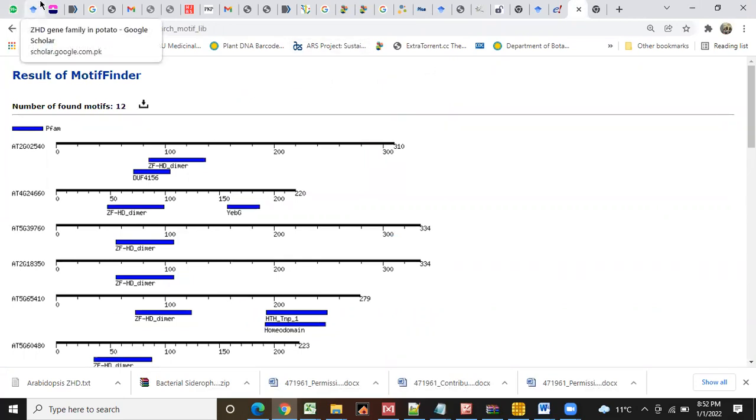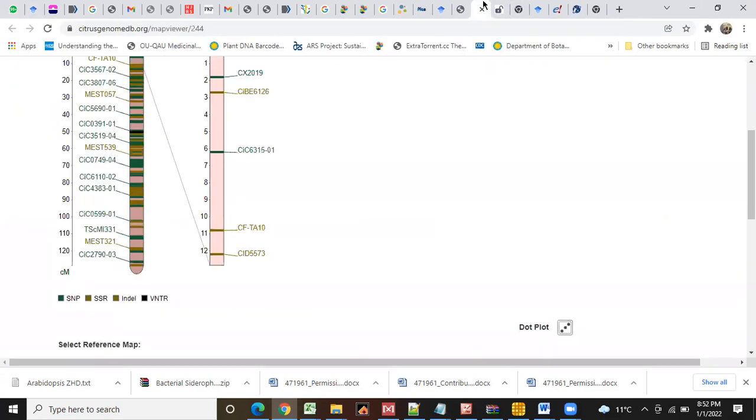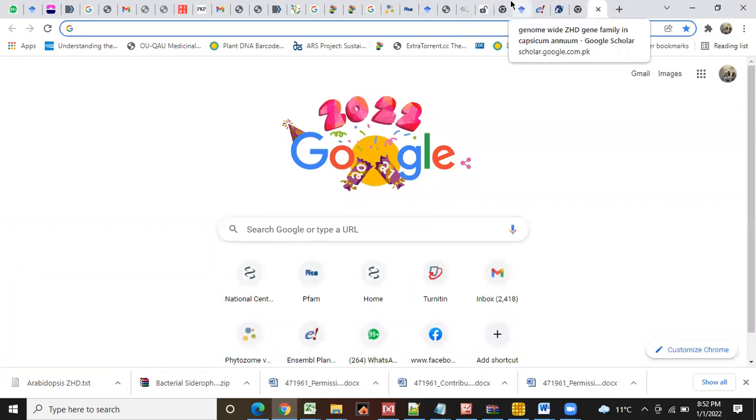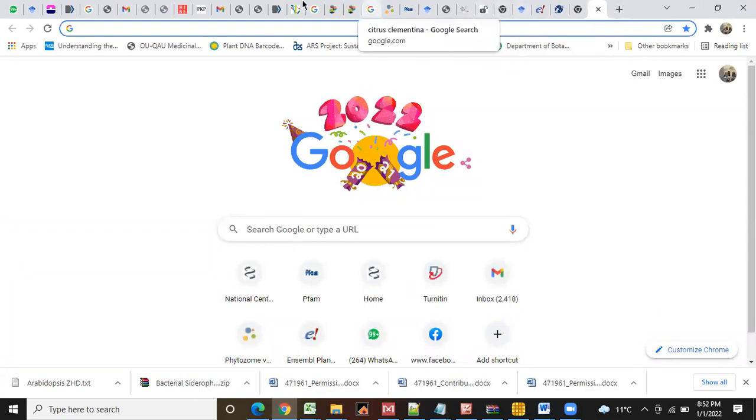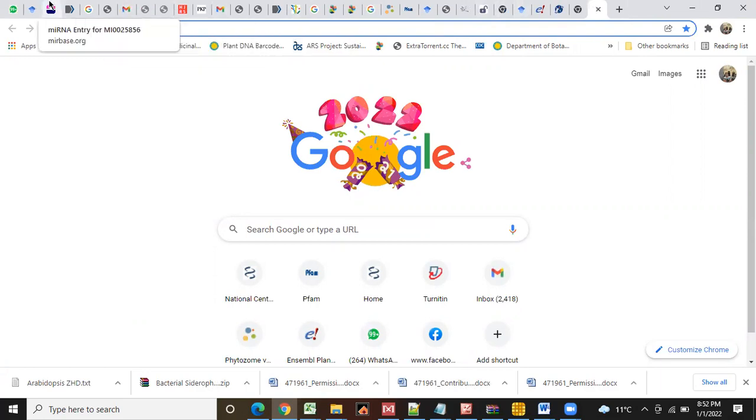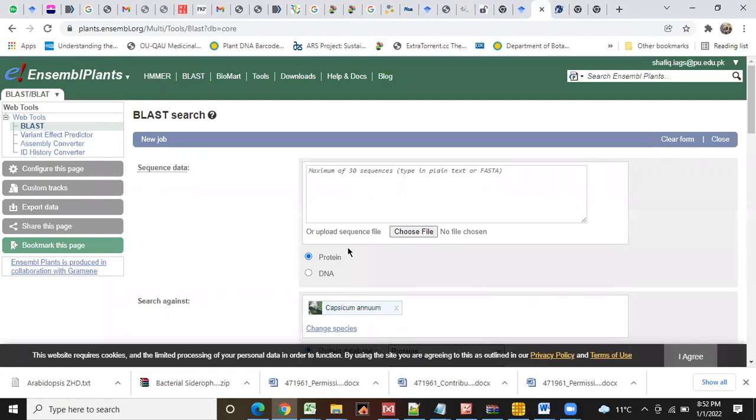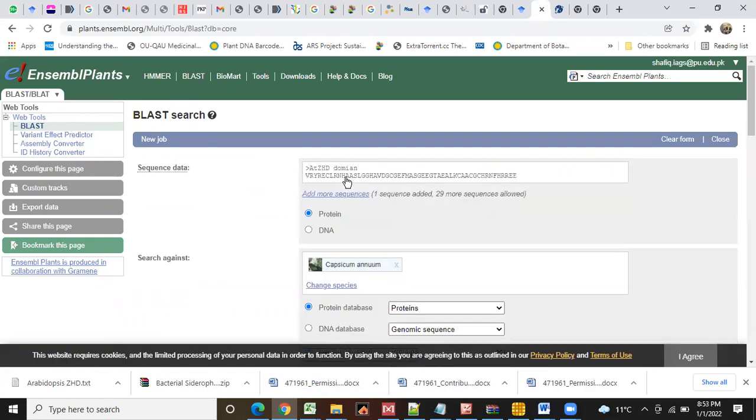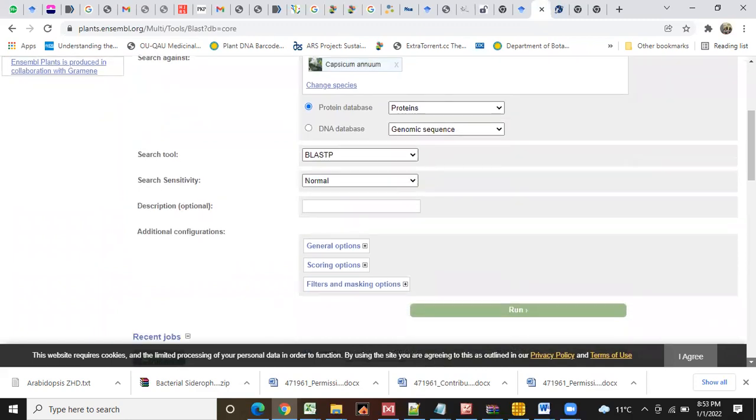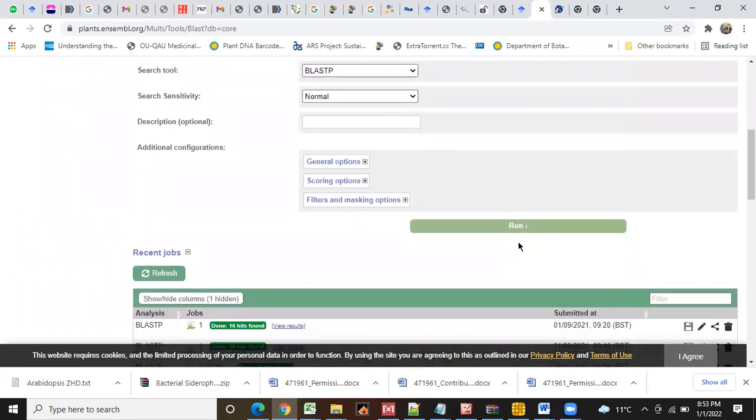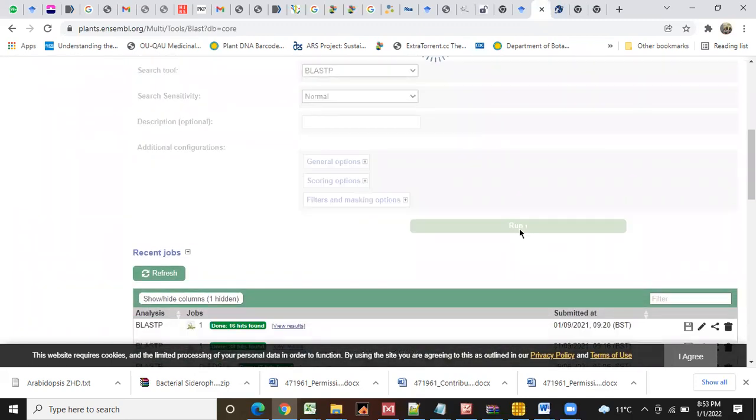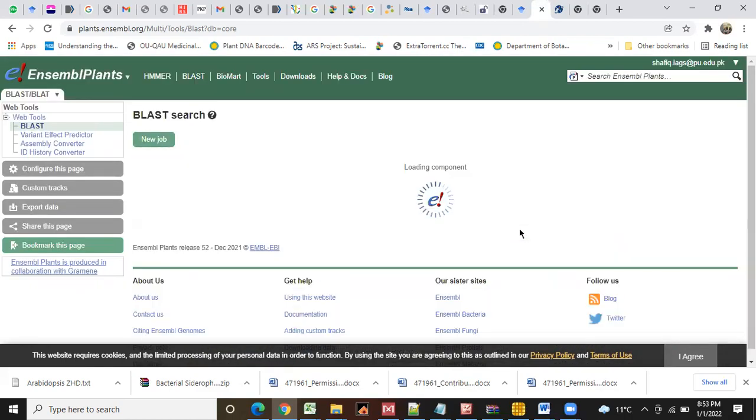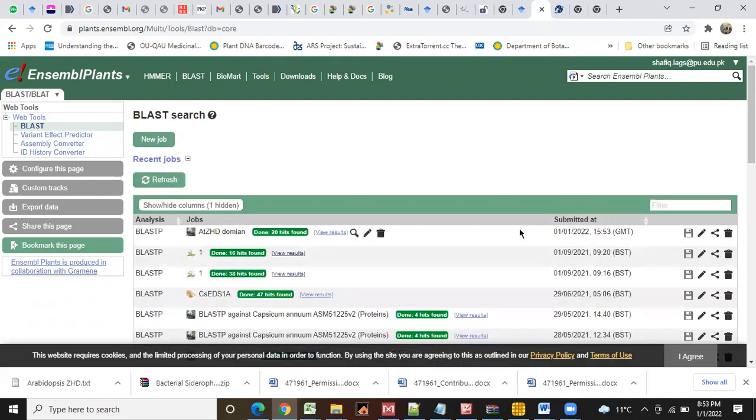You know, the Capsicum annuum data are available at Ensemble database. Here I already have this option - BLAST - and here we will add that domain. And then we will run this. You know how to download the sequences from this database, Plant Ensemble.